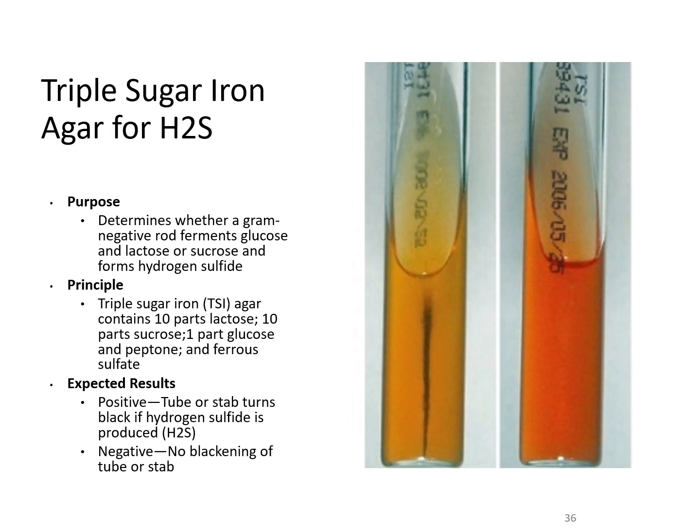The triple sugar iron agar, it's also used for your gram-negative organisms, but it can be used for our gram-positive bacilli when we're looking to see if it is producing that H2S. And so what happens here is the organism is inoculated again with one of those straight metal needles, and you would stab down into the agar, and what you're looking for is that blackening within that agar, in which it has produced that H2S.